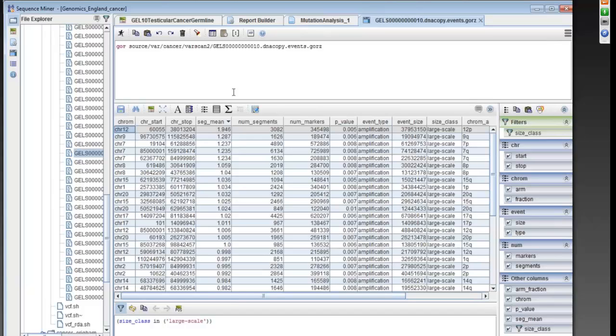Common NUT fusion is a NUT fusion with a bromodomain gene. In this case, we see a fusion between NUT and a kinase domain gene, CSNK1G3, which is a gene in the Wnt signaling pathway. So we see here a fusion between NUT and a Wnt signaling pathway gene, which might be interesting for this cancer. We reported that as well.